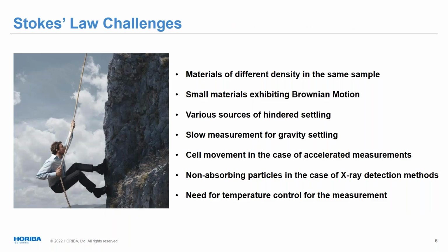Now, as we're going to do this measurement, there's certain things you've got to pay attention to right from the start that are going to be very challenging. One thing is if you have particles of different density, they're all going to be settling at different settling velocities, and you really can only measure, these numbers we talked about, the time it took to settle and the concentration of the particles that had settled.